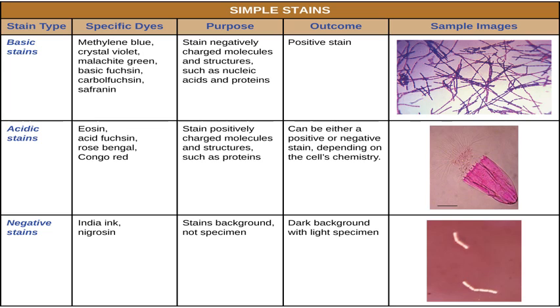So these are the different types of stains which we can employ in simple staining.